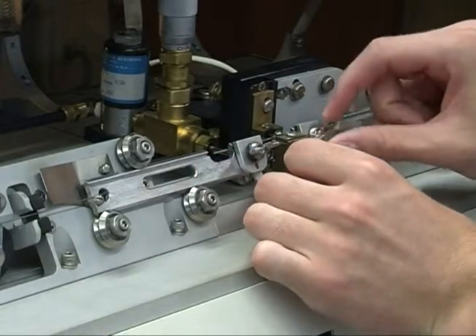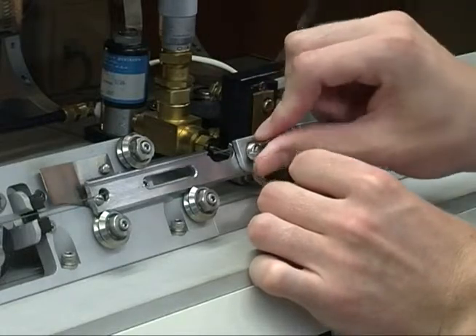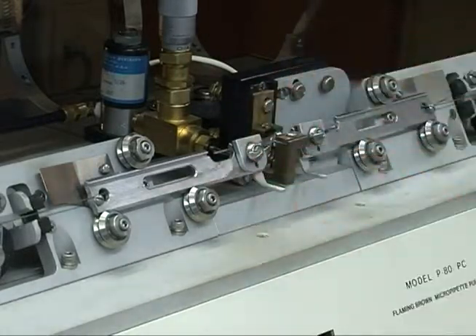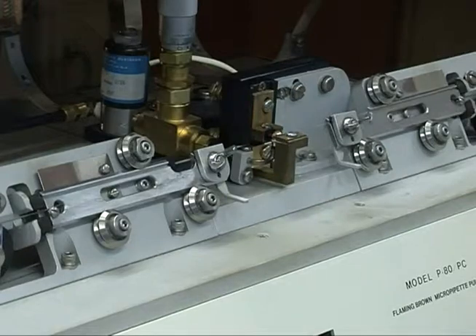And this filament gets very, very hot. And as it gets hot, it heats up the glass, and compressed air pulls the glass tube apart, which pulls the middle of it into a very, very fine point.